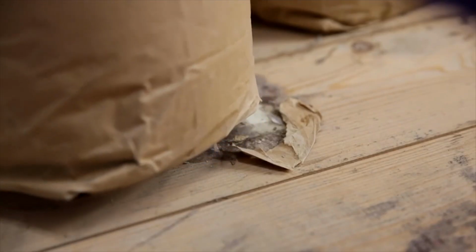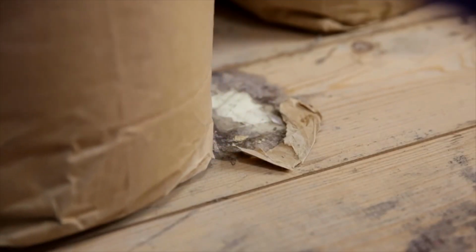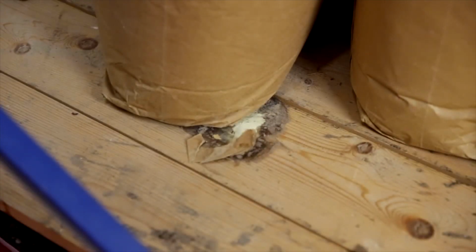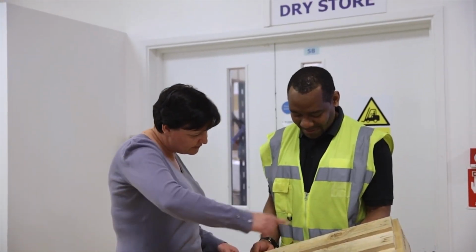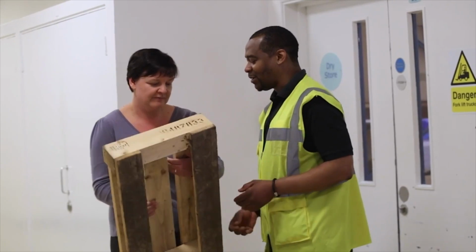And I think some of the beauty with the extraction techniques as well is that we can also do a lot of raw material investigations to try and understand where the taint might have come from. So the extractions that we do, we can then follow up with looking at packaging or pallet wood, because they can often be the two main contributors to halogenated phenol taints. And these often are the things that people ask for quickly, aren't they? So this could be on our emergency response service. We need this as fast as possible. It's holding up production. They can be massive issues for people.